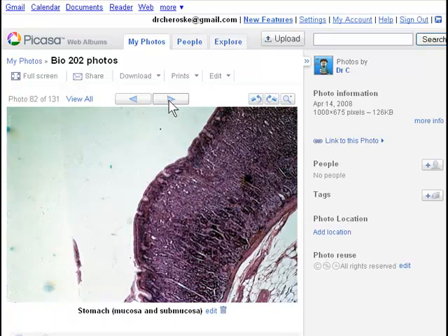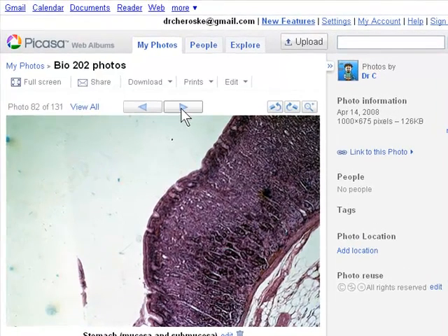All right, next what we get to is the alimentary canal, and there are three sections of that: the stomach slide, the duodenum slide, and the ileum slide. The first thing you want to orient on is the fact that, of course, because these are all part of the muscular tube, these are going to be similar. Okay?